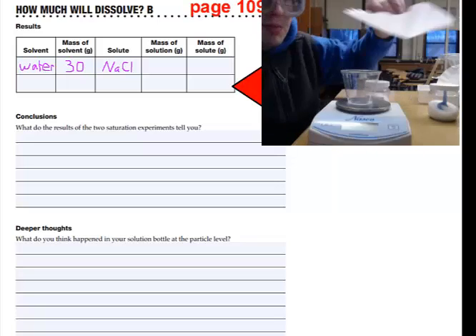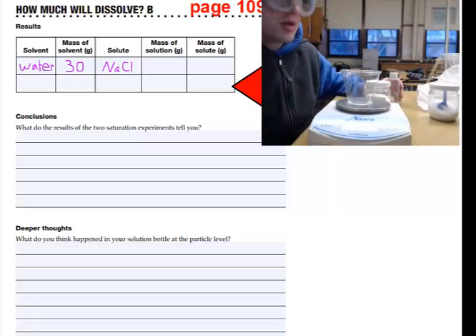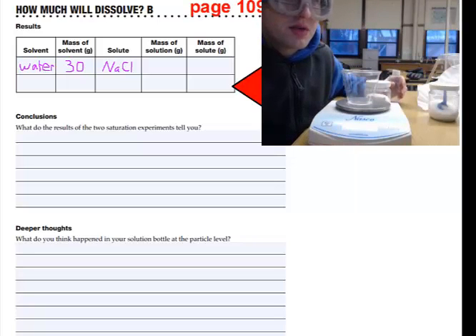Be sure to clean up your lab station. Used filter paper can go in the trash. Please rinse out your bottle when you're finished with it. Return your lab station to the way that you found it.